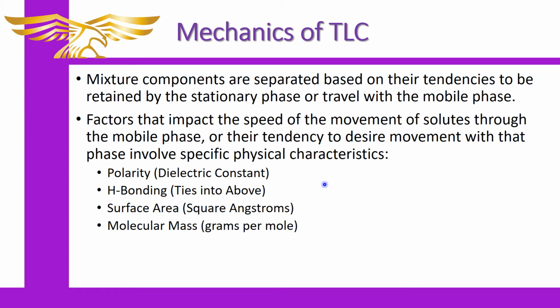But the bottom line here is that you don't have to do a lot of fancy measuring in order to pick a solvent. You can look at the properties of the compound. So, what I would typically do is look at the structure of the compounds I want to separate. If I know some are more polar than others, I'm going to try to add a little bit of a polar solvent in my solvent choice for my eluent, so that when I do the separation, I'm sure that there will be separation between more hydrocarbon-oriented molecules versus the polar ones. So it's kind of a qualitative approach.